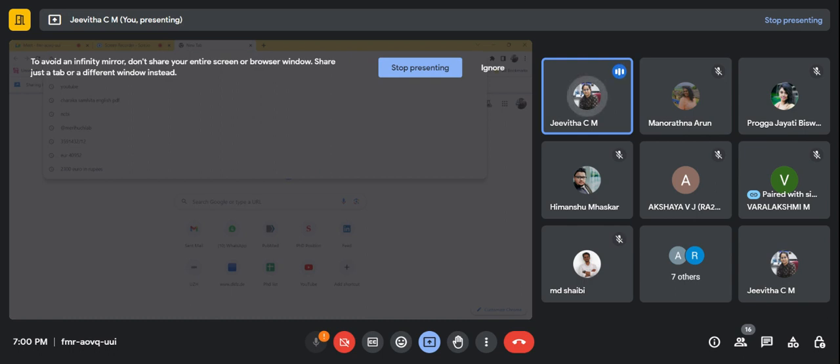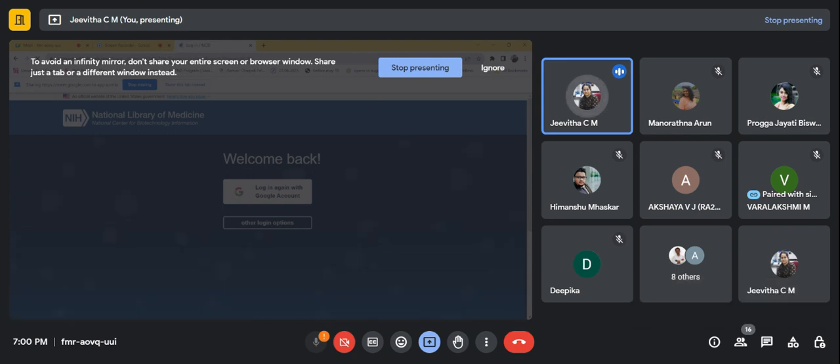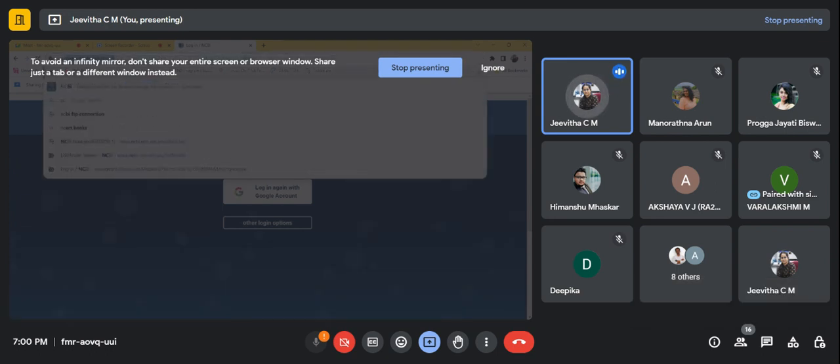So now, for example, I'll be taking some random sequences from NCBI. There are two ways you will be having the sequence. One is that you know you have to amplify a particular gene. For example, you know that you have to amplify the insulin gene. Then you can directly take that insulin gene from NCBI, and you can start designing the primers.